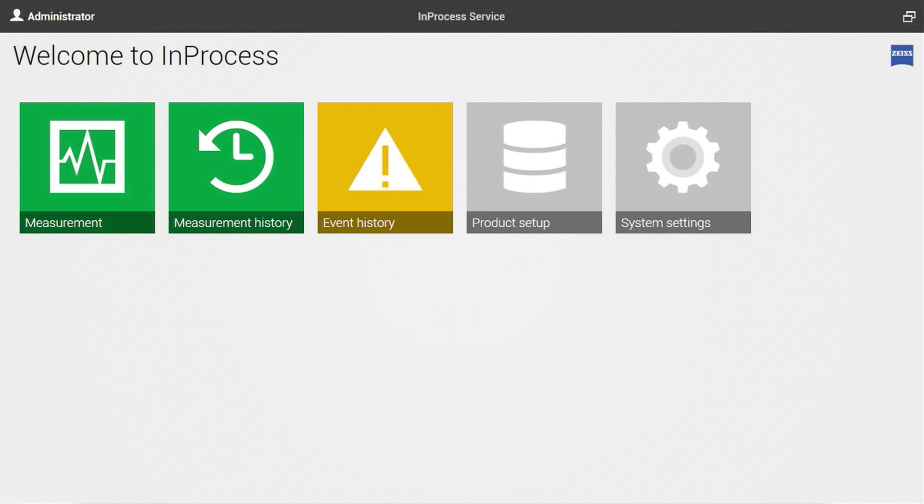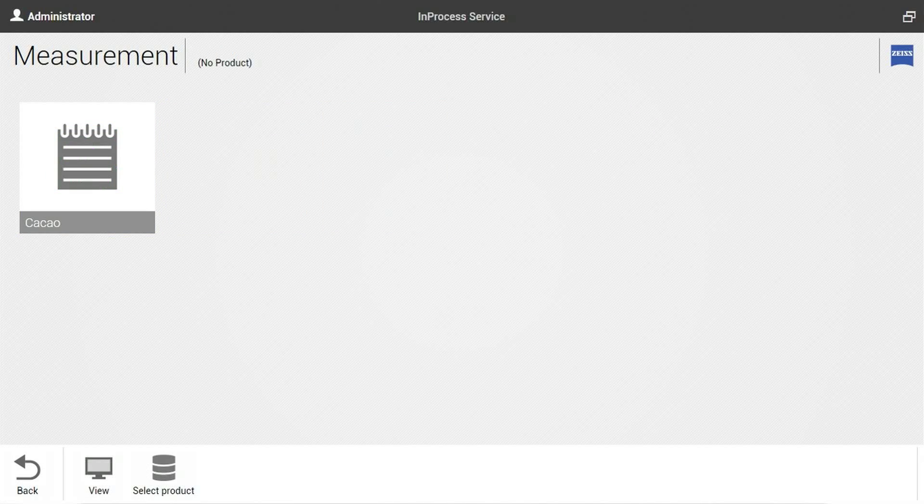To select a product to use we have to go into the measurement view. Here will be a list of all available products with the Cacao product that we are going to use right now.